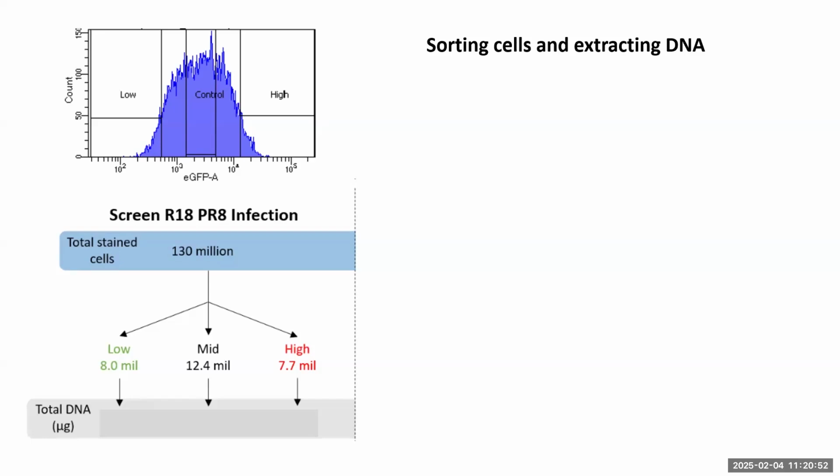Leave the virus on too long with influenza, it starts killing the cells. What you end up with there is not only fewer cells, you end up with a lot of debris. When you're sorting the cells, debris starts messing with your cell counts and can stick to things. The debris also still has signal from the virus. So that was one of the key things.